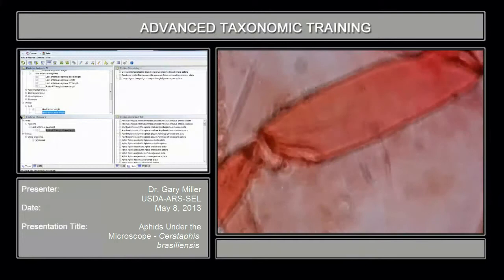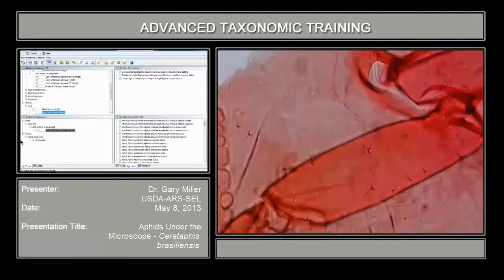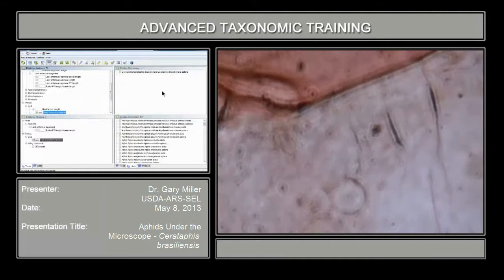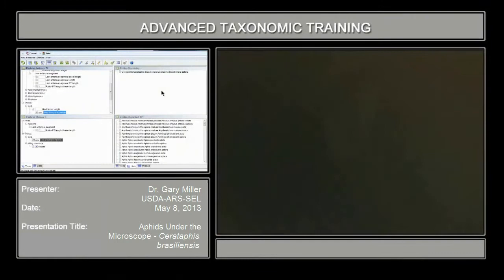Let's try the hind femur seta length. Moving to the femur — there's the femur, and you can see the various setae present there. You want to pick out one and measure the length. In this case you measure in microns, so you did have to do the micron measurements. That pruned it down to one species — the final species: Cerataphis brasiliensis.